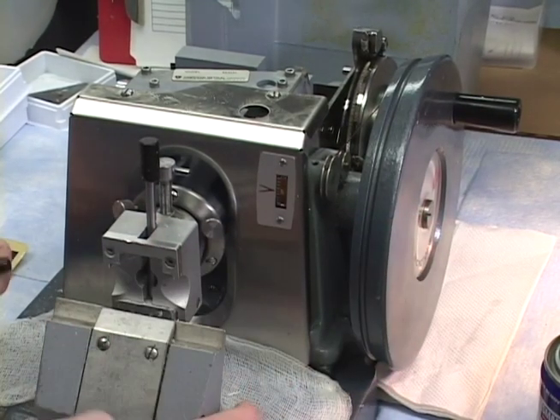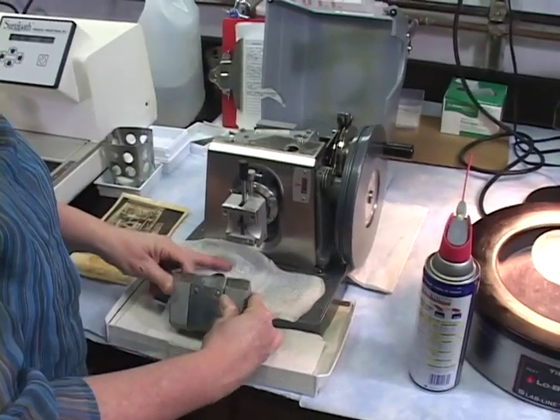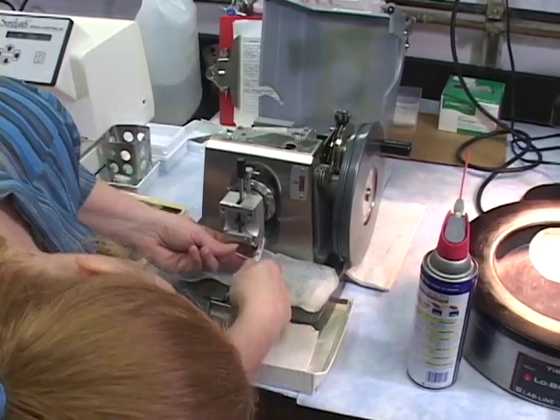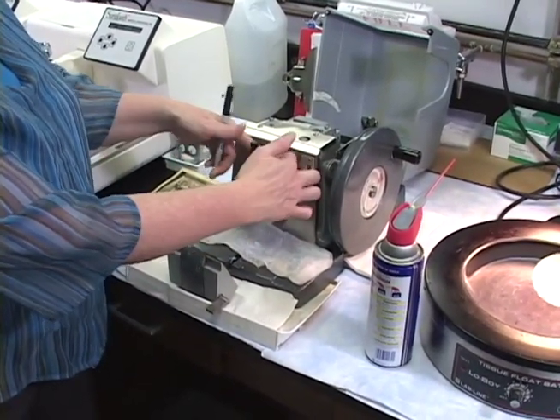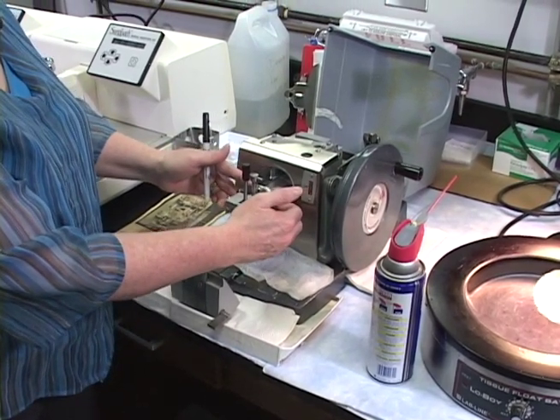There's also, you don't need to remove this, I'm just showing you for this purpose. There's also a slide underneath here that makes this unit. Now you don't want to pull this chuck, but you can pull behind here, this round part, and you want this to move freely.